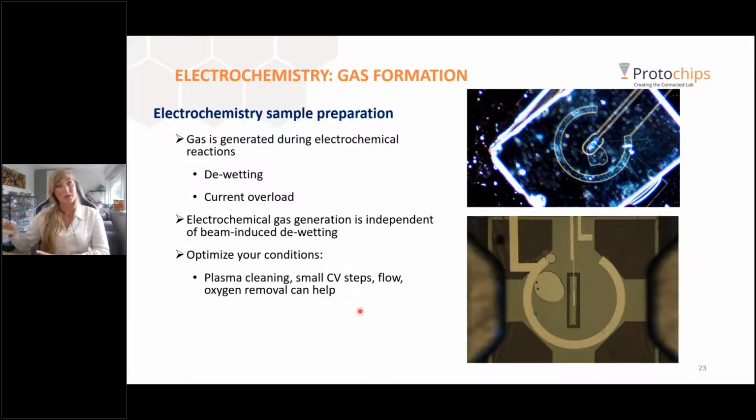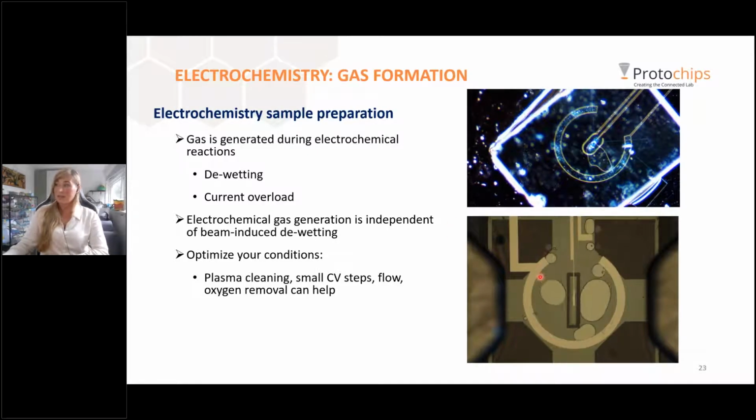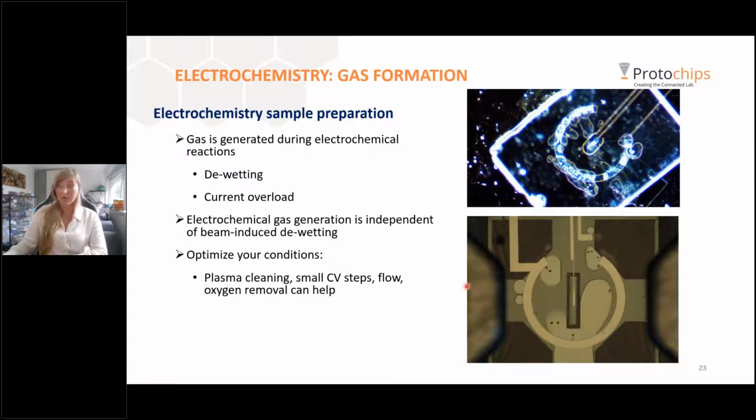If you're not doing saturated gas electrochemistry, so no saturated CO2 or oxygen, then one thing that we always recommend is to sonicate your electrolyte beforehand to remove as much oxygen from your sample as possible, because most gas generation is oxygen or hydrogen during your reaction and will look something like this. This can dry out your entire cell and you're not able to do any of your reaction anymore. And next to that sonication, we also have now these new e-chips that can actually make a really nice way of still observing your working electrode, which is here on the window, while your counter electrode might be making a lot of bubbles during your experiment.